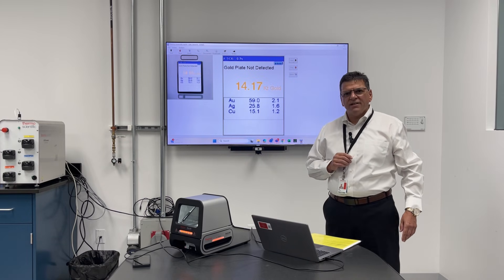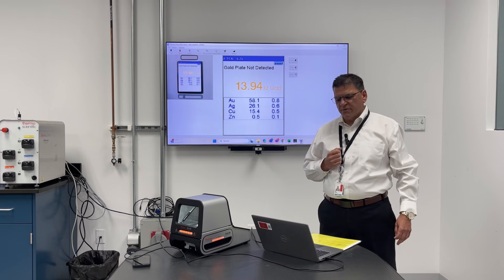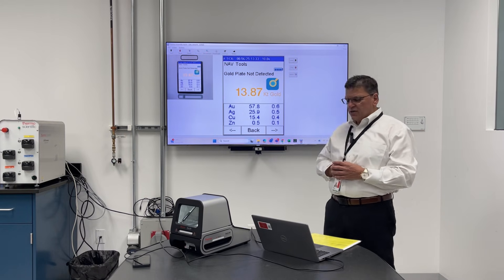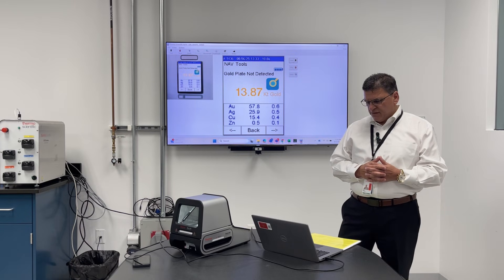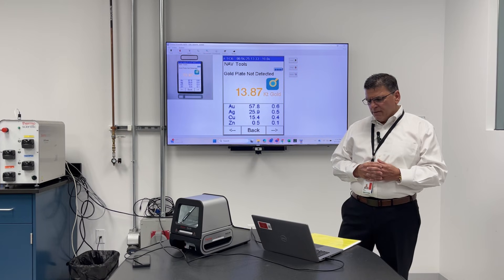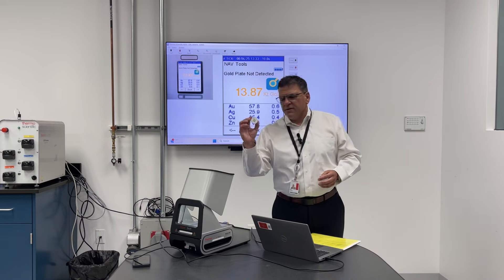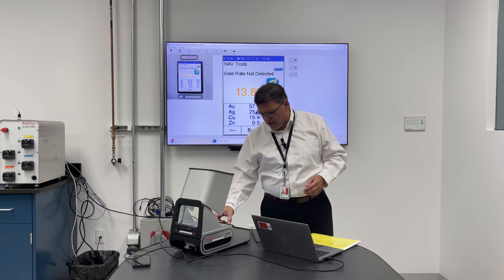Within seconds, it's determining the other elements found in the material. This is a good representation of 14 carat: a blend of 58% gold, 25.9% silver, copper, and zinc. These are typical blends for annealing the characteristics together. At that point, you reference to the customer that the material and the analyzer are calibrated and certified against those standards.